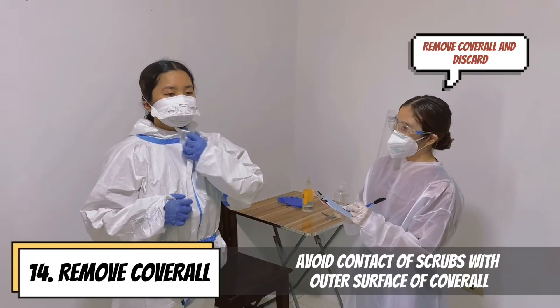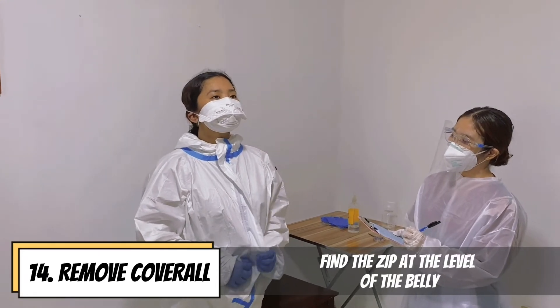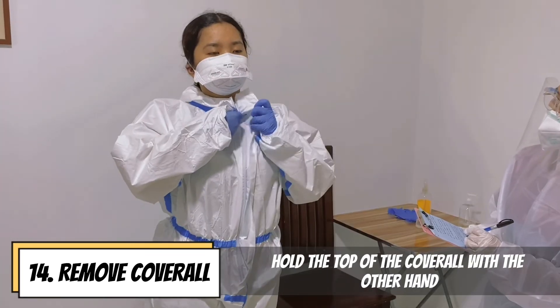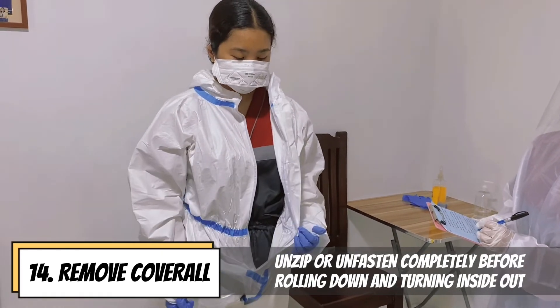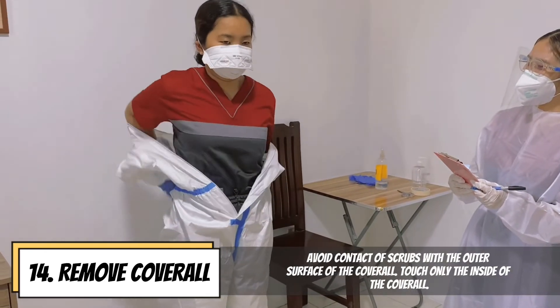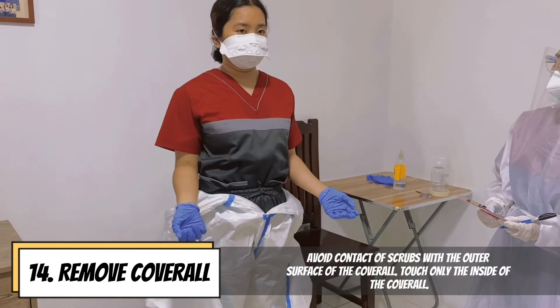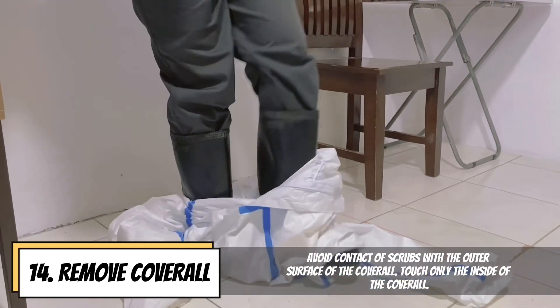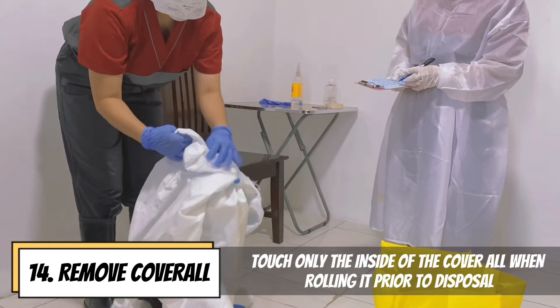Remove coverall and avoid contact of scrubs with the outer surface. Lift your chin. Find the zip at the level of the belly and carefully trace your fingers up to the zip tab and fasteners with one hand. Hold the top of the coverall with the other hand and unzip or unfasten completely before rolling down and turning inside out. Avoid contact of scrubs with the outer surface and touch only the inside of the coverall when rolling it prior to disposal.